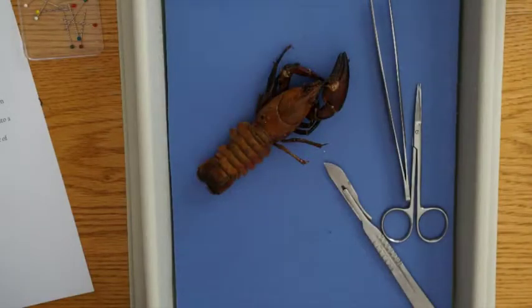Welcome to our crayfish dissection. You'll need your crayfish, a dissection tray, scalpel, scissors, and forceps. You won't need the pins today because we're working with an animal with an exoskeleton.